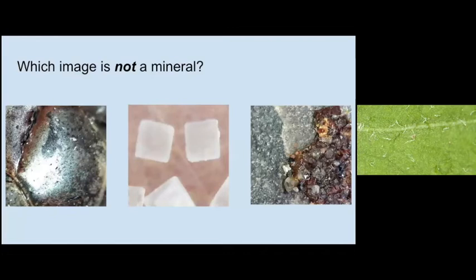You want to say? You're actually unmuted. Go ahead. It might actually be the first one. What makes you think that, Fern? Because it has tiny squares and not really like a mineral. Because minerals are kind of shiny, cool, and they don't have holes. Some do, but mostly don't.